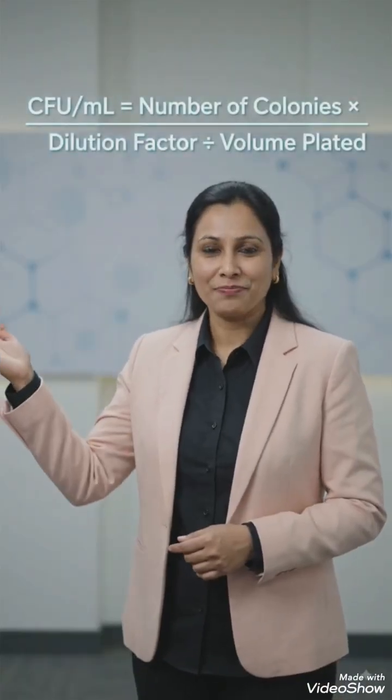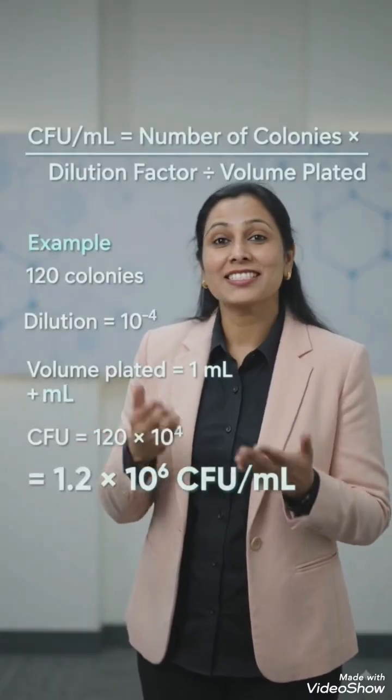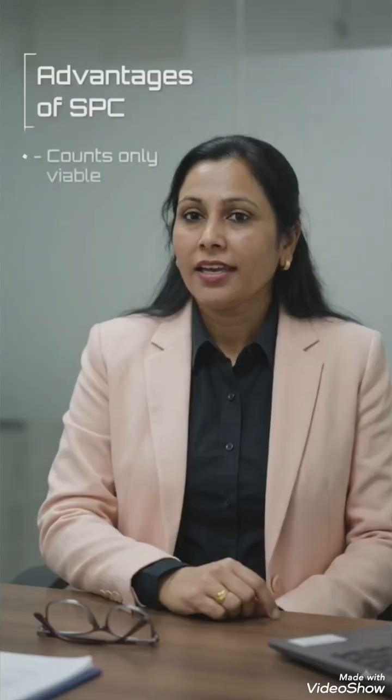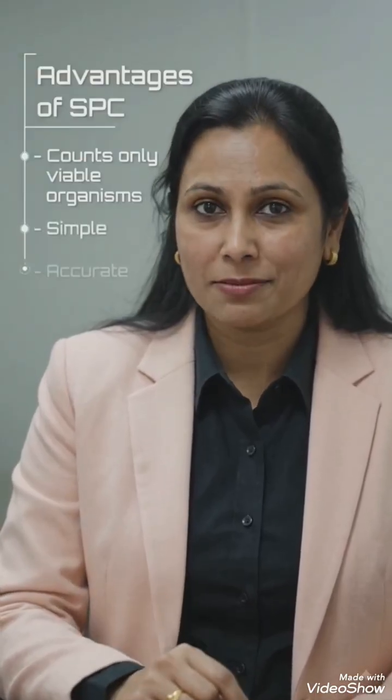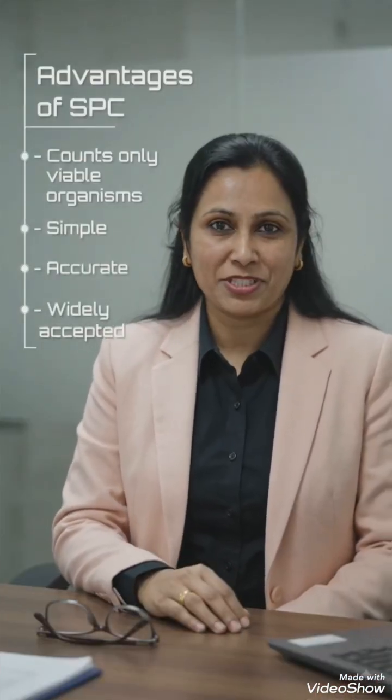Here is the formula. For example, with these values, that gives us this final result. Here are the advantages of SPC. It counts only viable organisms, it is simple and accurate, and it is widely accepted.